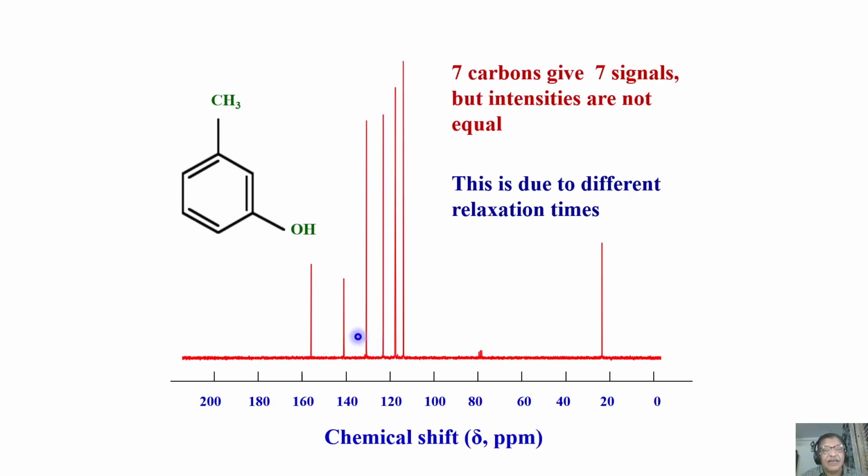You can still get them. You know what you have to do? You have to do an experiment wherein you apply one pulse and collect the signal, and if you want, keep on adding the signal, collecting more signal averaging for better signal to noise ratio. Before you apply a second pulse, you have to wait for a longer time. How much time? When I come to practical applications, practical difficulties in NMR, recording NMR spectra, I will discuss those things.